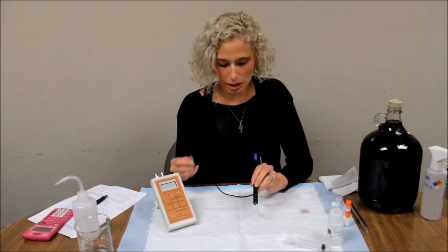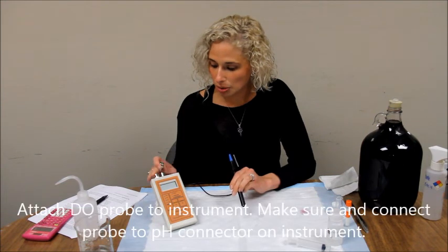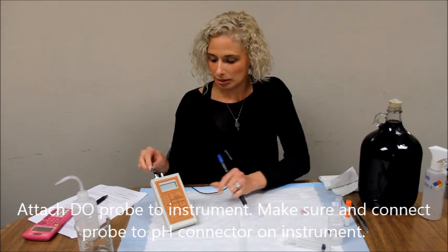Now attach your DO probe to your instrument. If your instrument has two connectors, make sure to connect to the PH-VNC connector.